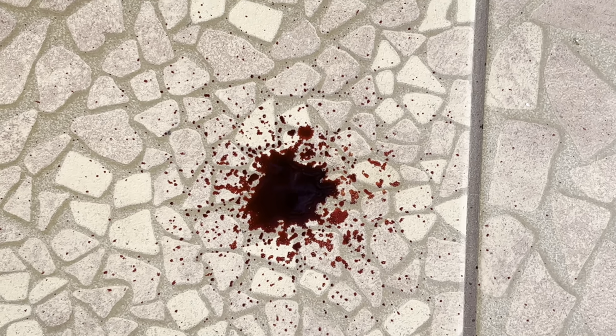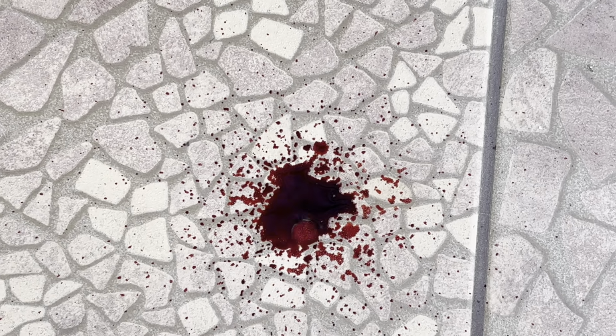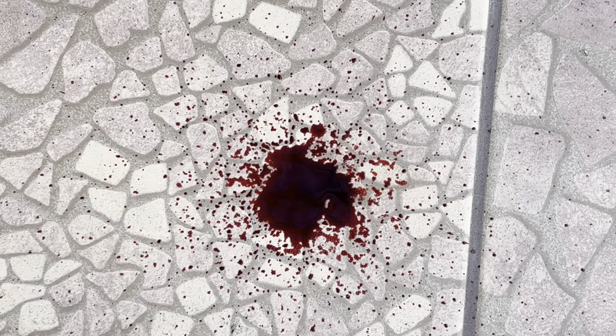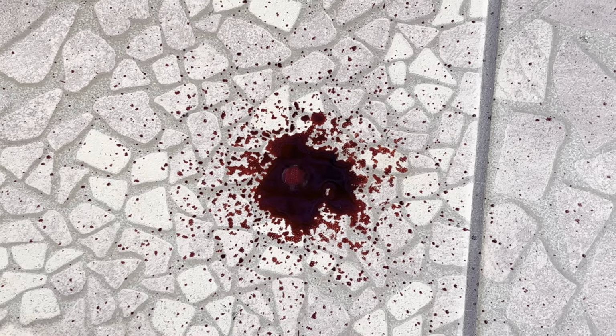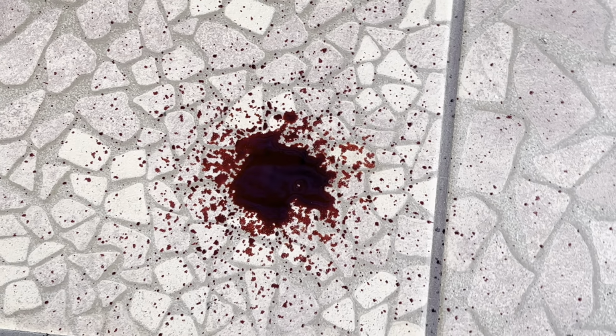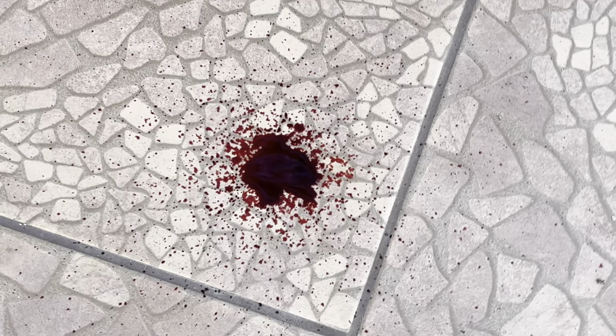So I'm going to fill up my pipette again, and I'm going to keep going because I want you to see what these blood into blood patterns actually look like as they're being created. This is going to be very unique to this type of scenario where blood is falling into other blood. This is the only mechanism that's going to create this pattern.